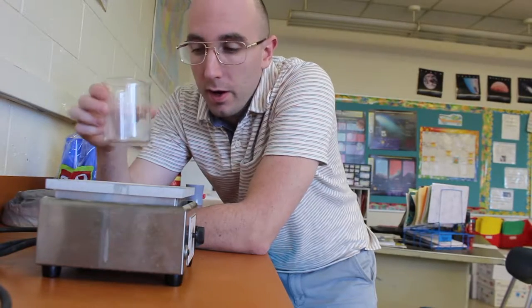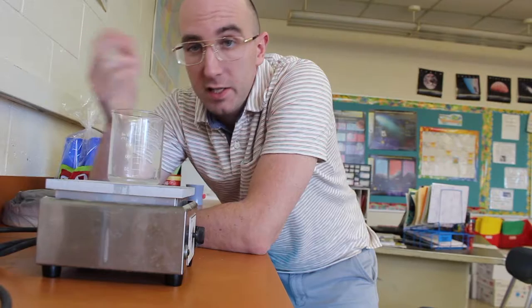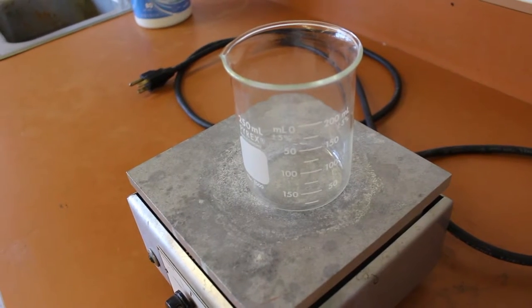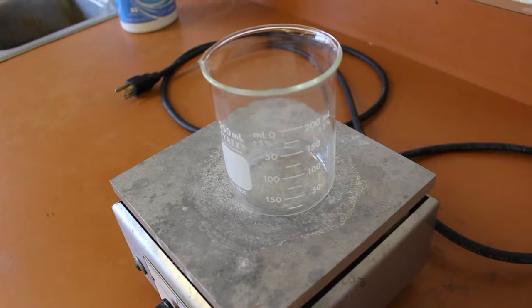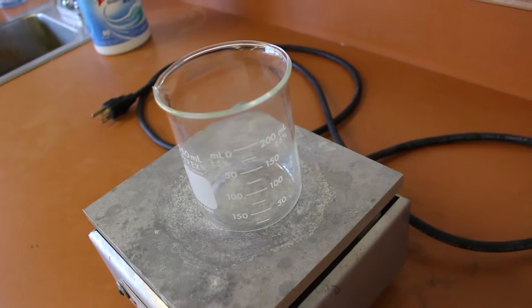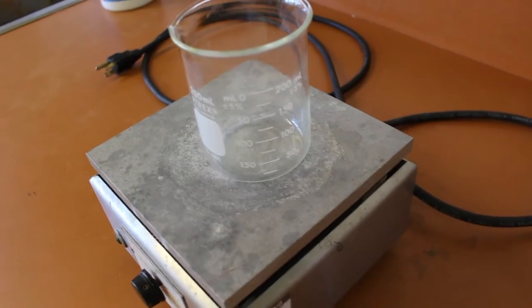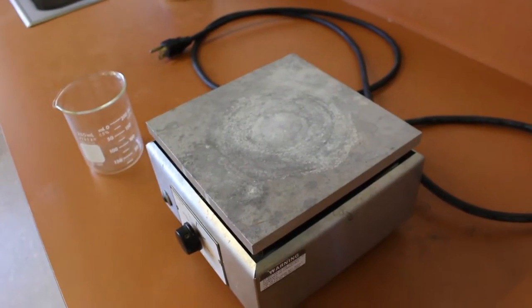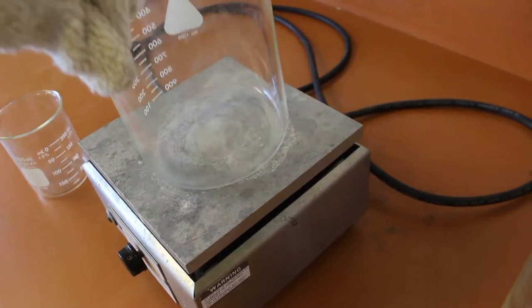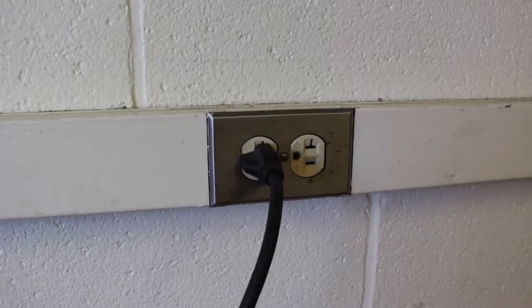First, when heating glassware on a hot plate, you want to make sure the glassware is the right size for the hot plate. It's dangerous to put a large beaker on a very small hot plate surface, but it's equally hazardous to put a very small beaker on a very large hot plate surface. The surface of your hot plate should be proportional to the beaker you use.